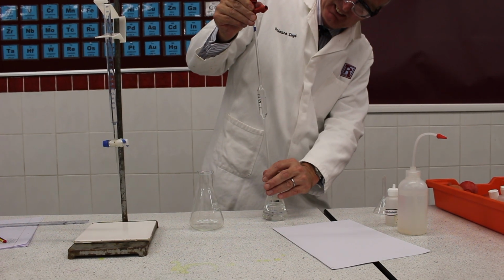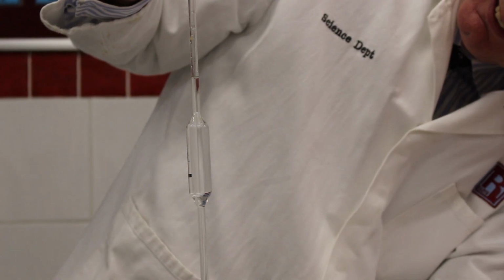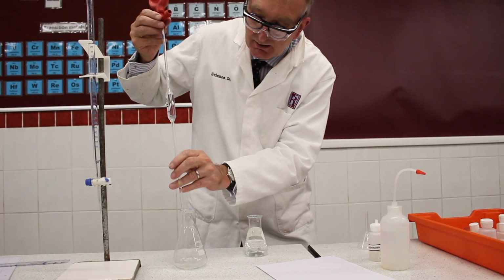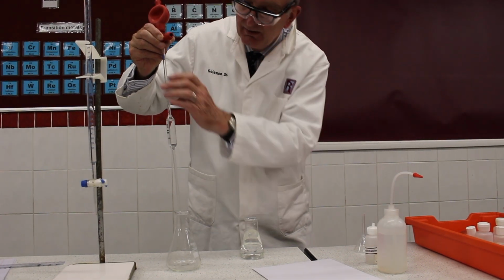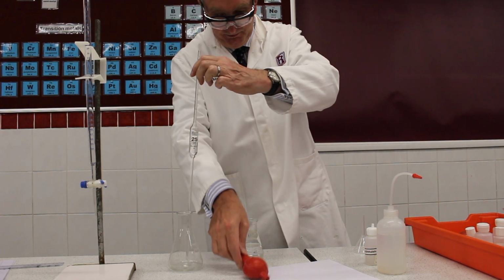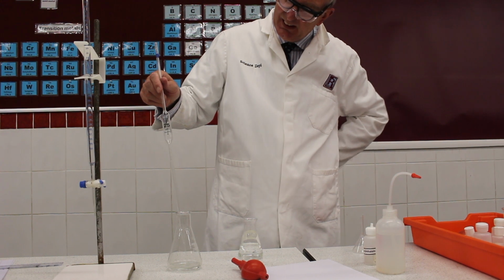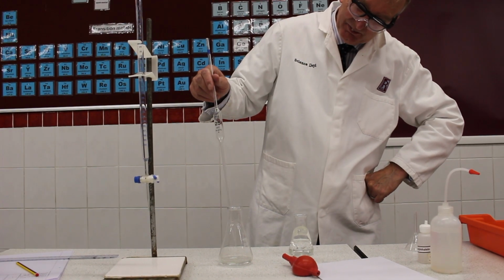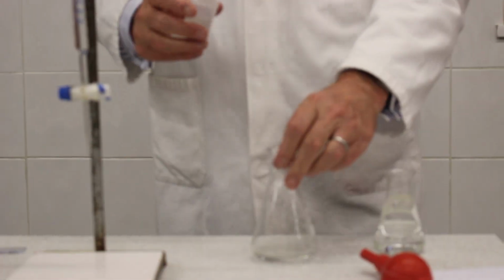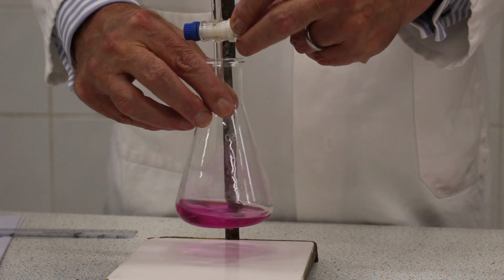Now the next thing that Mr. Firth does is he uses a pipette to measure out a known volume of alkali, in this case sodium hydroxide, because we're trying to make the salt sodium chloride. So he uses his pipette to measure out 25 centimetres cubed of the sodium hydroxide, and then he's going to add his indicator.